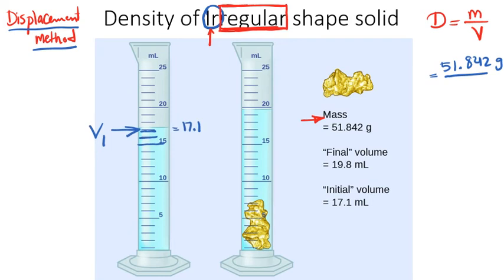Now I'm going to drop this object in the graduated cylinder and measure the volume one more time. We call that V2. Here I have water and object, so I'm going to measure that. 15, 16, 17, 18, 19, a little bit less than 20, so I'll say 19.8 mL for example.